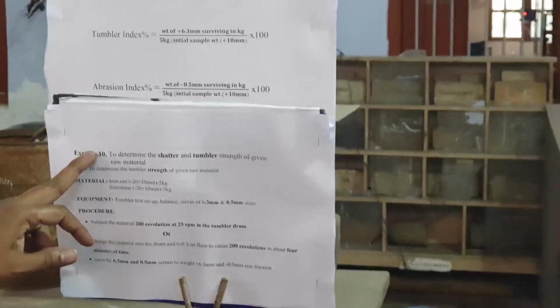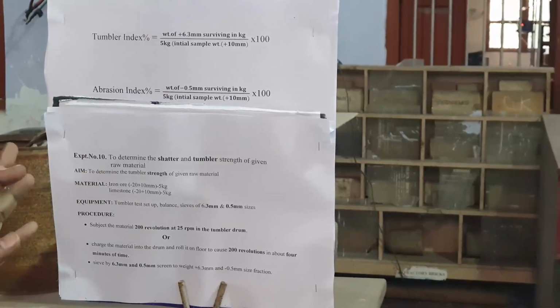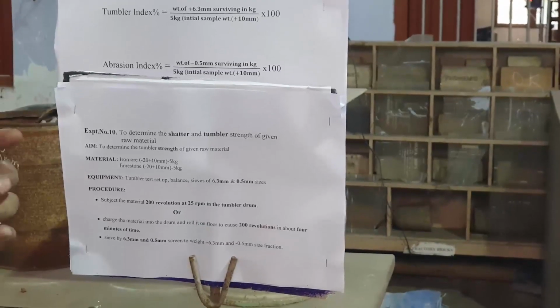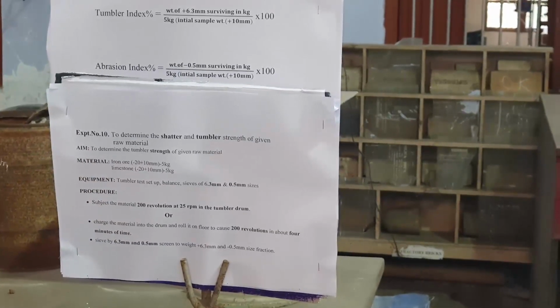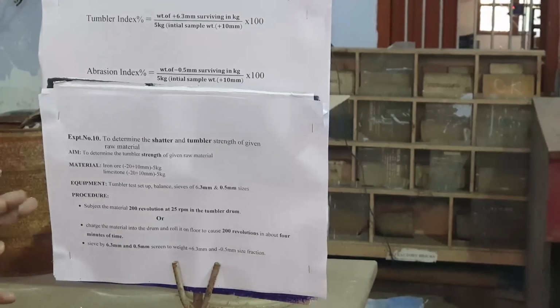This is experiment number 10. We are determining the shatter and tumbler strength of the given raw materials. Those two raw materials are iron ore and limestone. Previously we have done the shatter index, the percentage of shatter index we have calculated. Here in this segment we are going to determine the tumbler strength of the given raw materials, means iron ore and limestone. Both we are taking of the same size, minus 20 plus 10 mm.